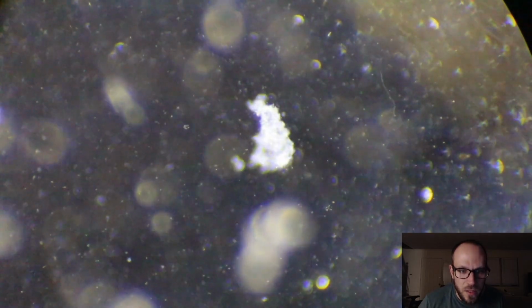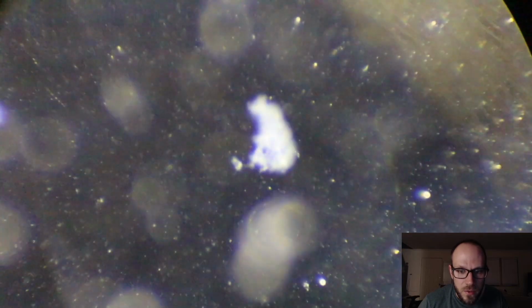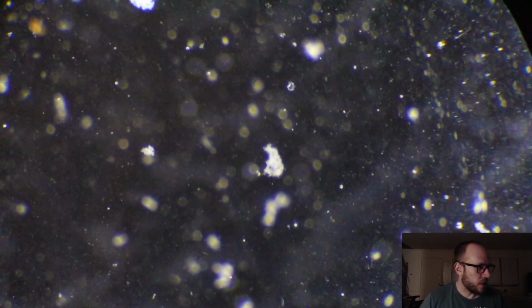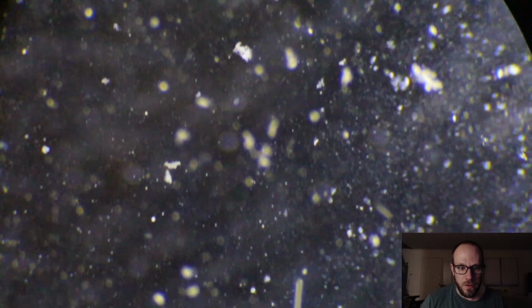Yeah, it's just a clump of garbage. You can still see some of those guys swimming around. And this is at 100x. They're so small. All right, back to 40x, and down we go. If you're in here, definitely say hi in the chat.